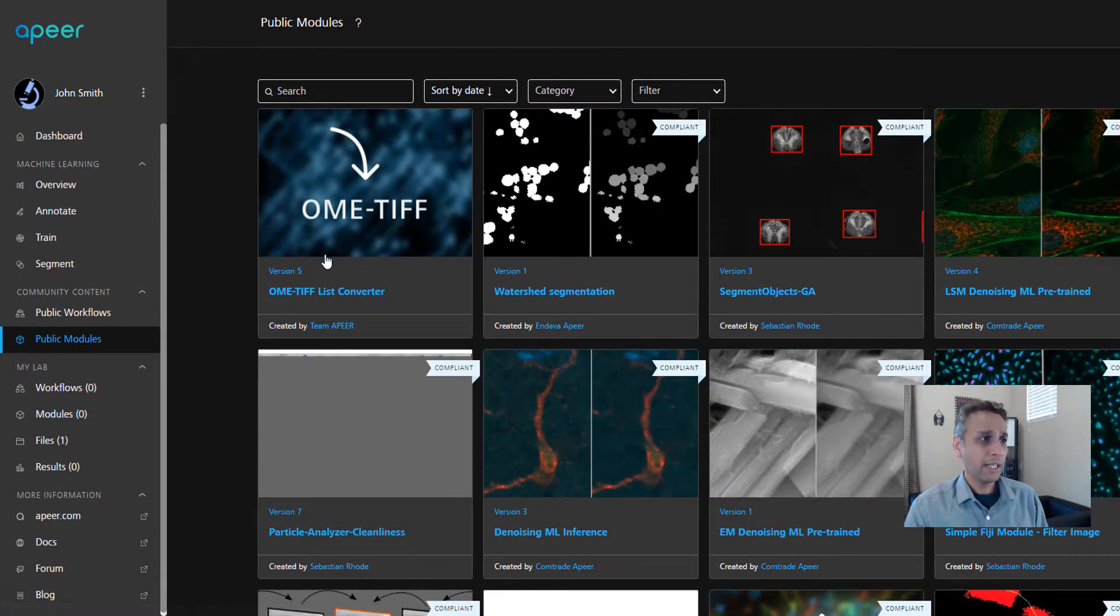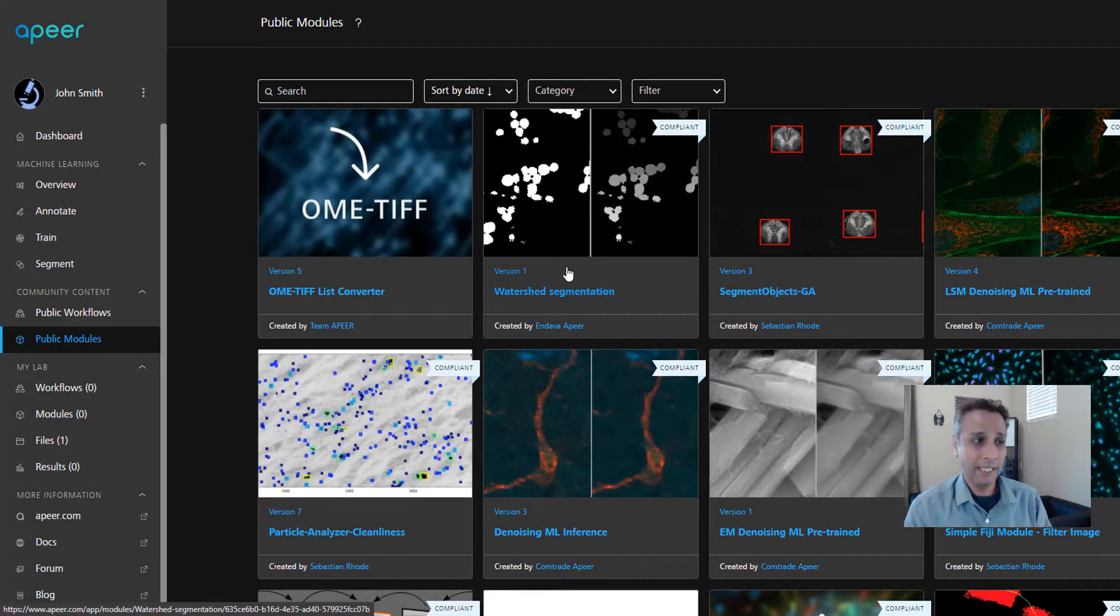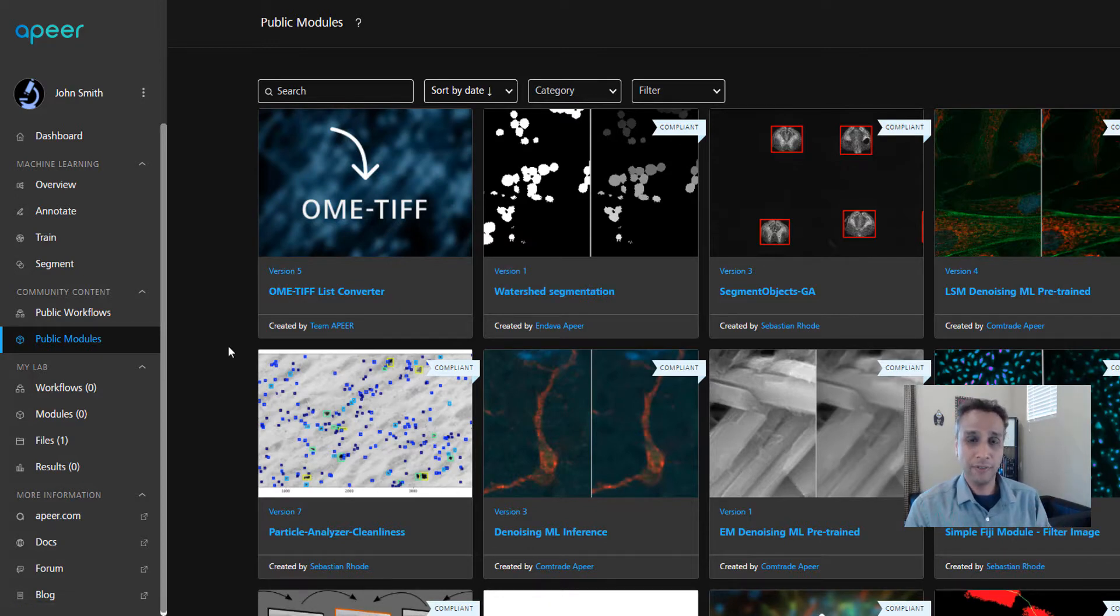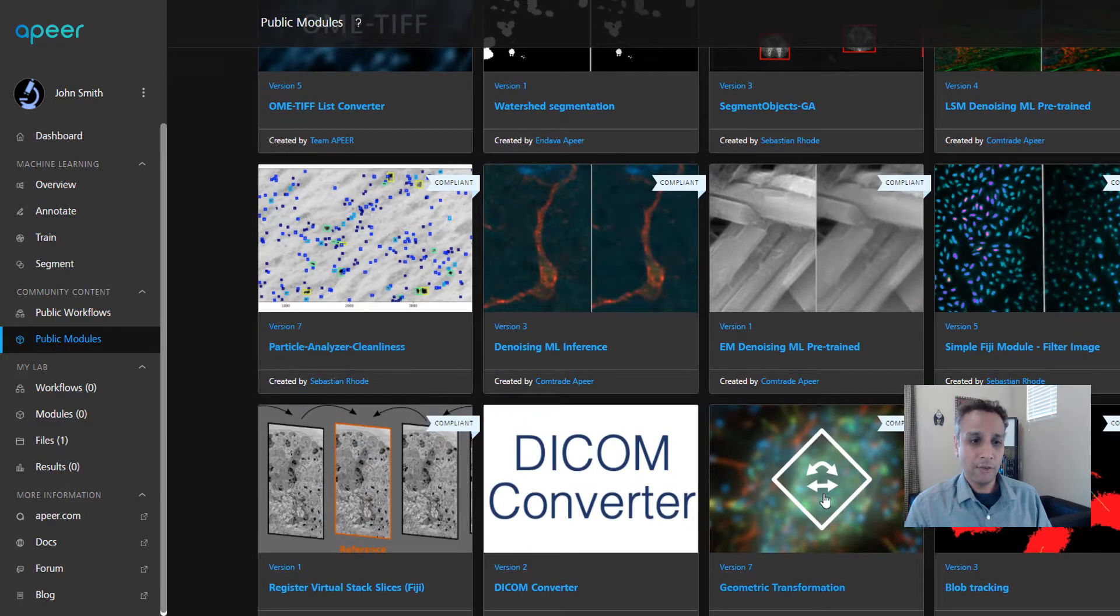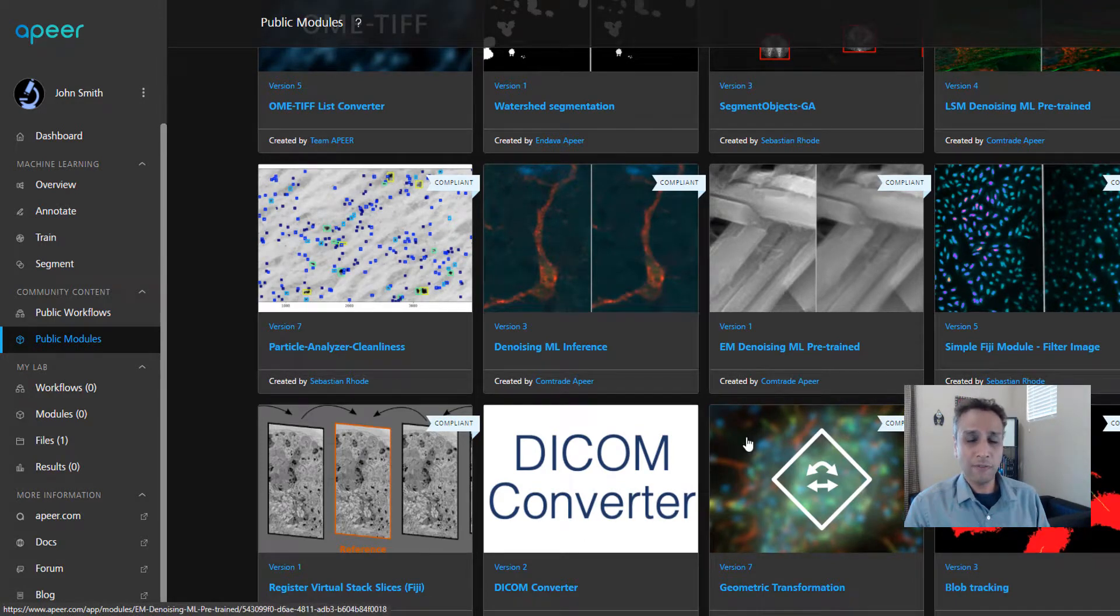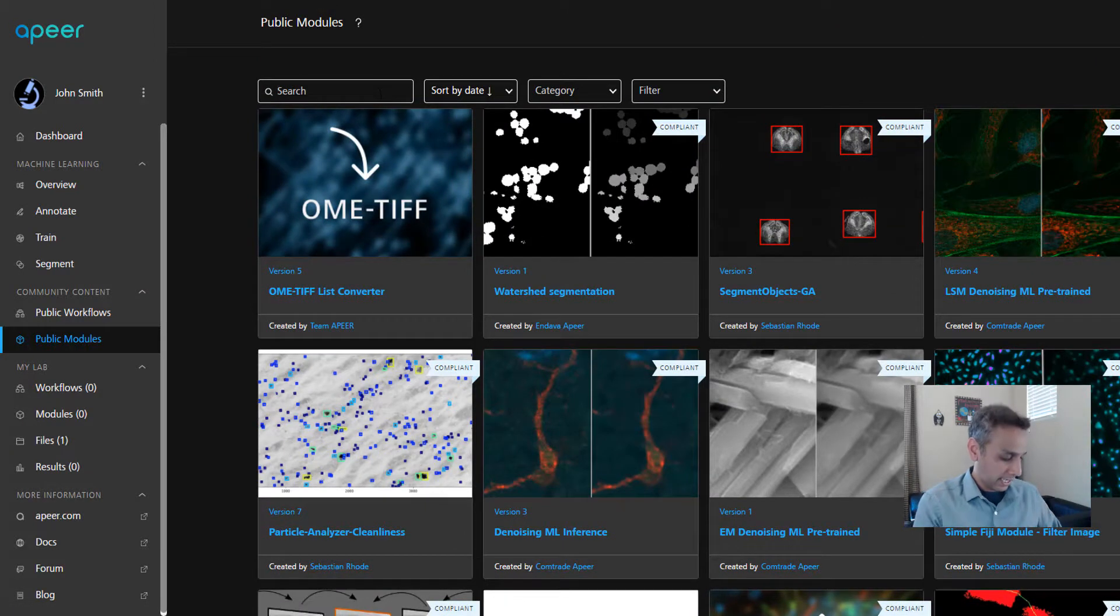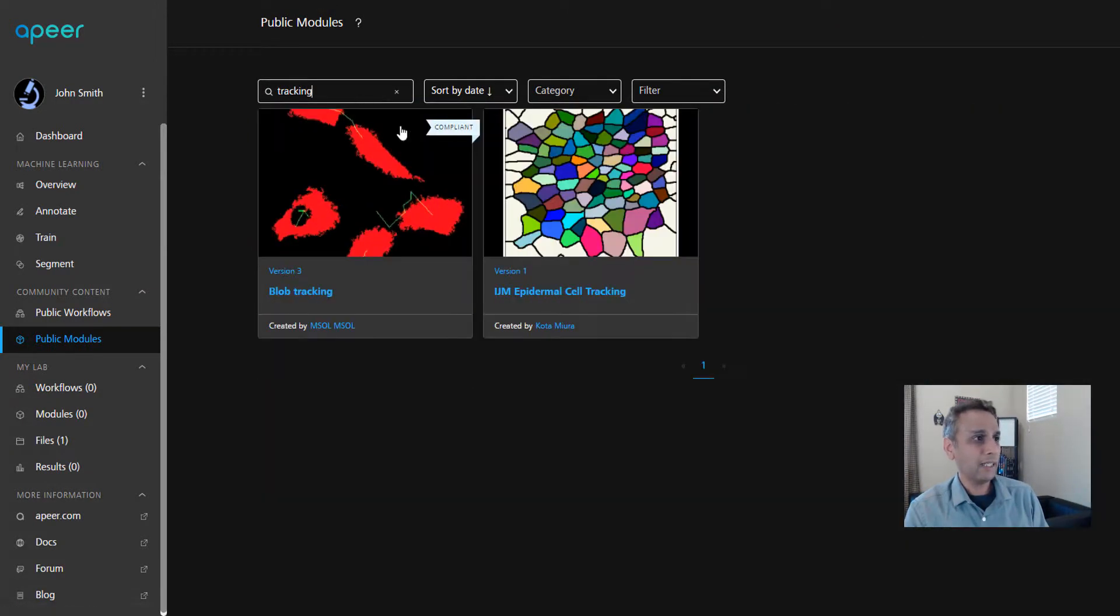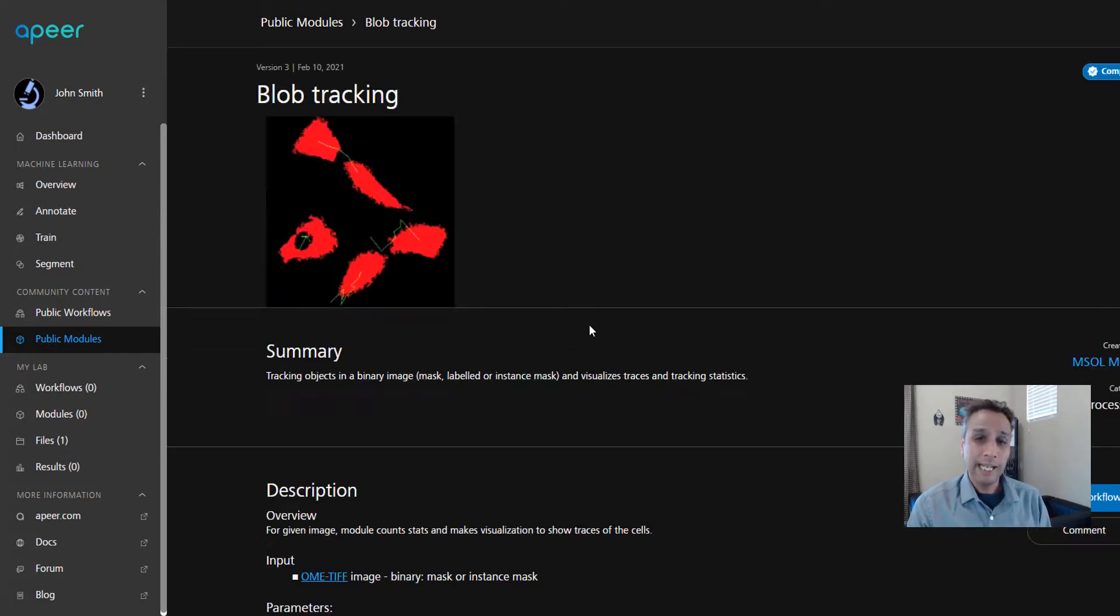Now let's jump into public modules. Here you can see a whole bunch of modules, and each module does something. This module does watershed segmentation, which we need for today's task. We also need thresholding and blob tracking. In this case, these are visible on the front page, but if not, go ahead and search for it. Let's type tracking, and you see there are two modules related to tracking.